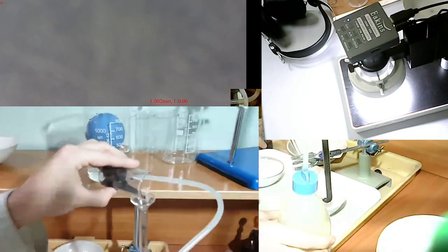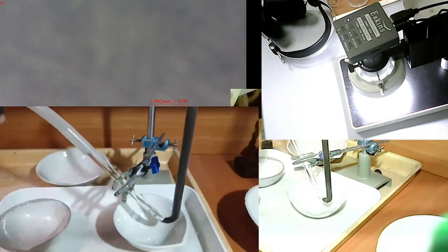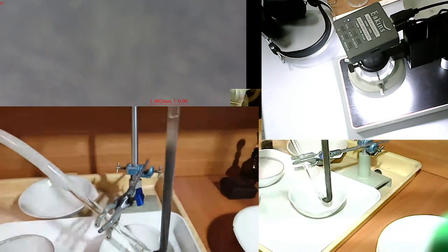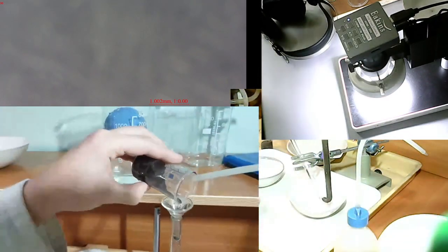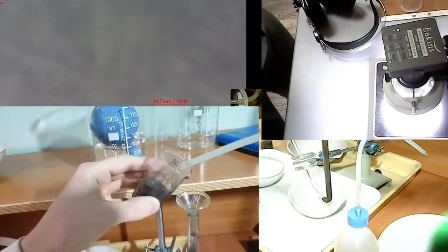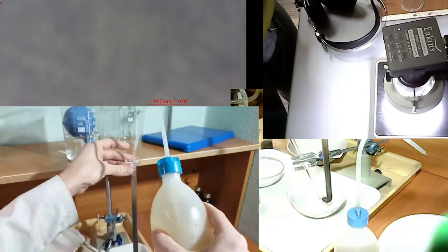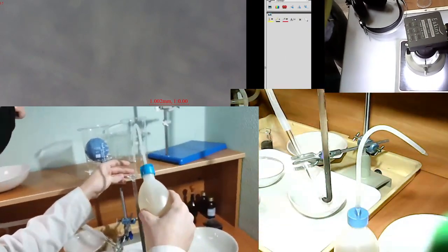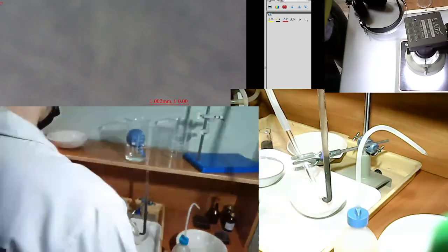And then the whole heavy elements as separate particles can be understood. What are these pollutants? So the soil is the same for pollution, can be understood. So one of the applications of highly sensitive hydroseparation method.